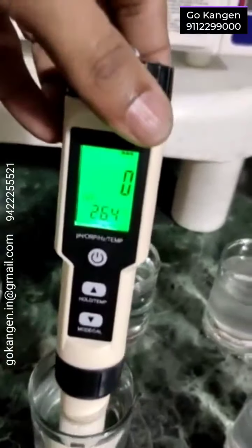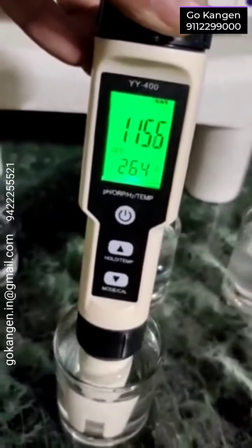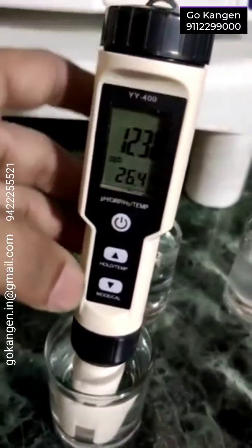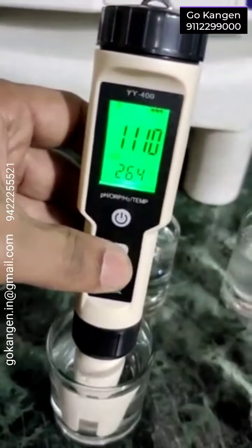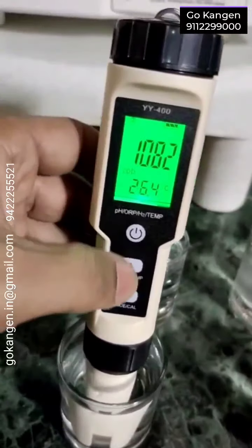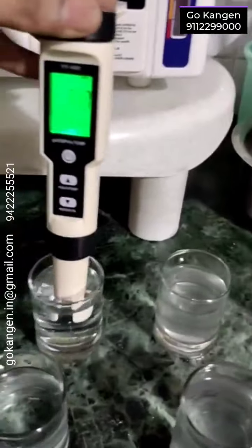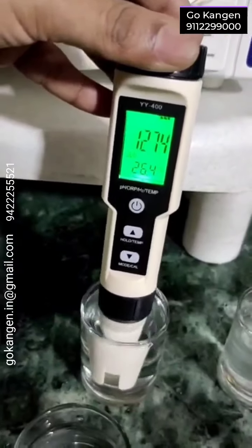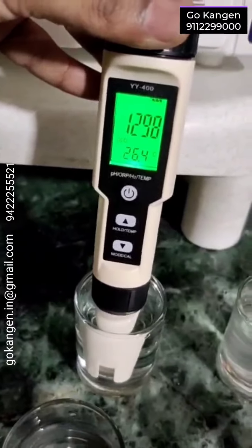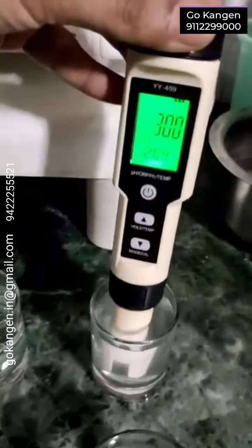Now let's test in 9.5. And yes — this is what we were waiting for, to show that our Kangen water 9.5 has dissolved hydrogen. Let's test this one now. This is fresh — you can see, more than 1300. More than 1200 parts per million in 11.5.